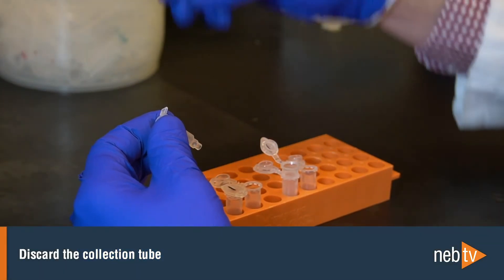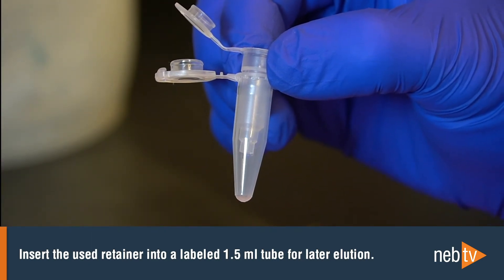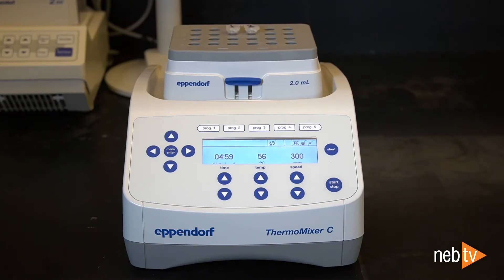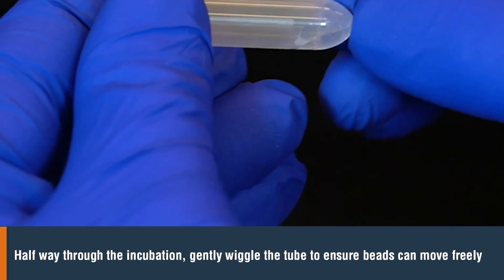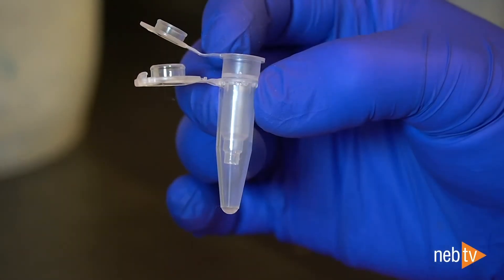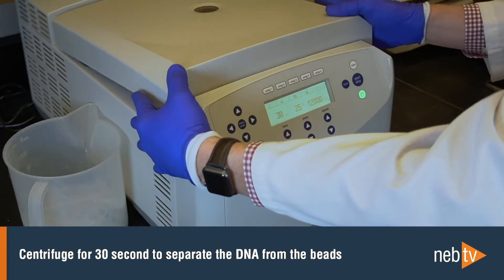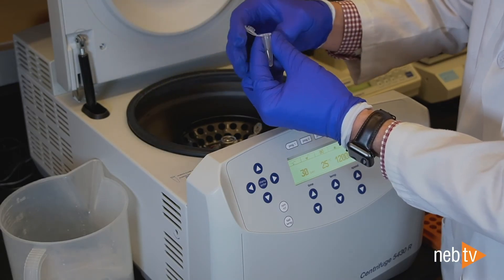Separate the bead retainer from the collection tube, discard the collection tube, and pour the beads into a new labeled 2 mL tube. Insert the used bead retainer into a labeled low-bind 1.5 mL microfuge tube — this will be used later for elution. Add 100 microliters of elution buffer onto the glass beads and incubate for 5 minutes at 56 degrees Celsius in a thermal mixer with agitation at the lowest speed. Halfway through this incubation, take the sample out of the incubator and tilt the tube almost horizontally and shake it gently. This ensures that the beads can move freely, allowing for complete release of the DNA from the beads. Place the sample back into the thermal mixer and finish the incubation. Make sure the bead retainer is inserted into the 1.5 mL microfuge tube. After the 5-minute incubation, pour the eluate and the glass beads into that bead retainer and close the cap. Centrifuge for 30 seconds to separate the eluate from the glass beads. When taking the samples out of the centrifuge, remove and discard the bead retainer with the beads, and close the microfuge tube containing your eluate.